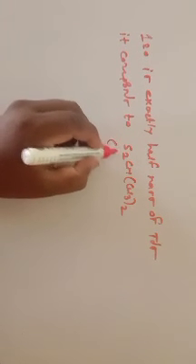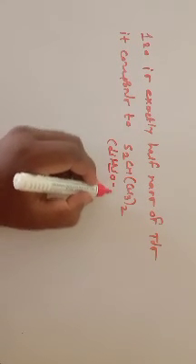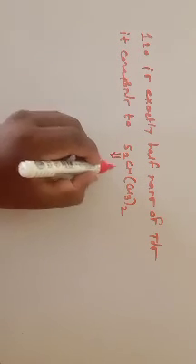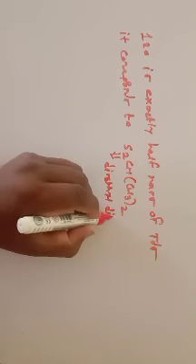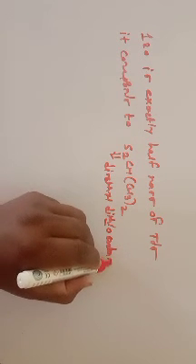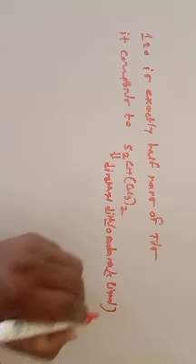So this is your dithiocarbamate, dimethyl. So what is its name? That is your dimethyl dithiocarbamate ligand.